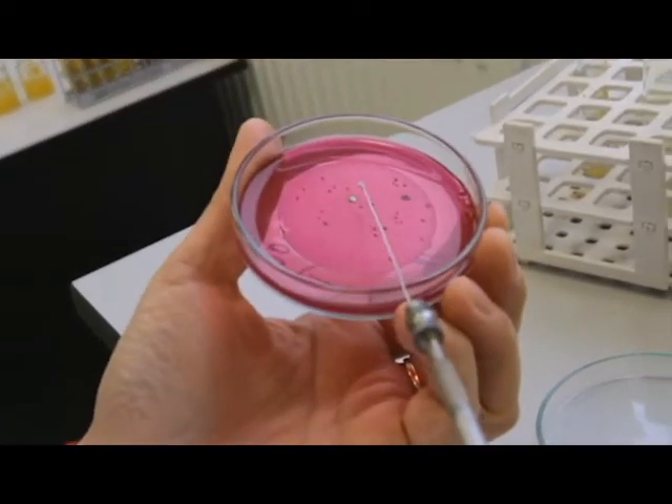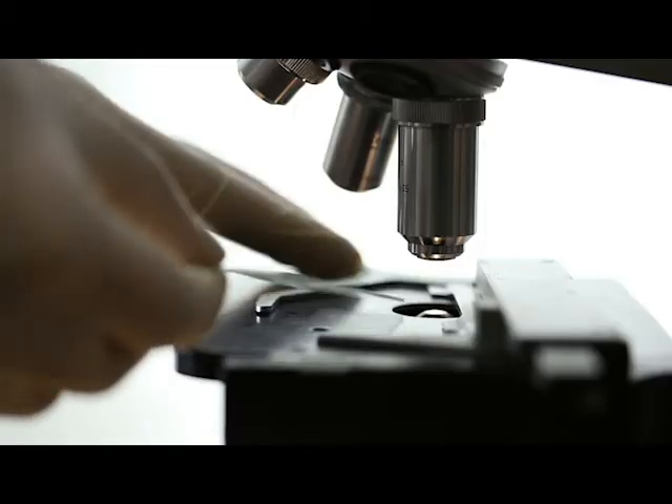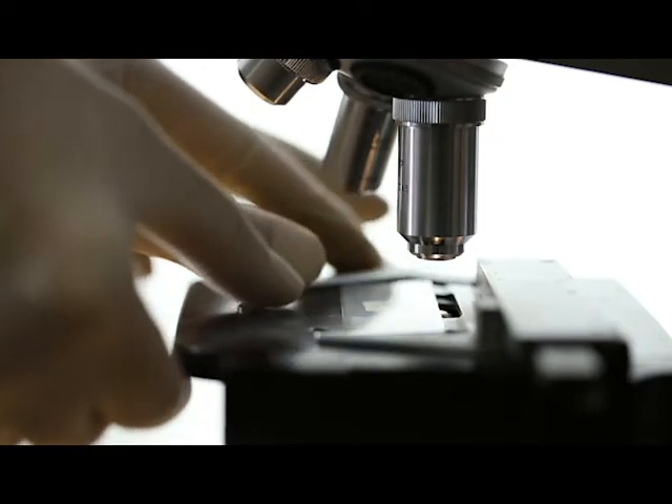Meet the new highly accurate MicroSense High Temp Incubator IR CO2 sensor for life sciences. If you're in a laboratory working with cell cultures, tissue samples, or bacteria, the MicroSense High Temp Incubator IR CO2 sensor — or MH100 — is going to save you valuable time and money.